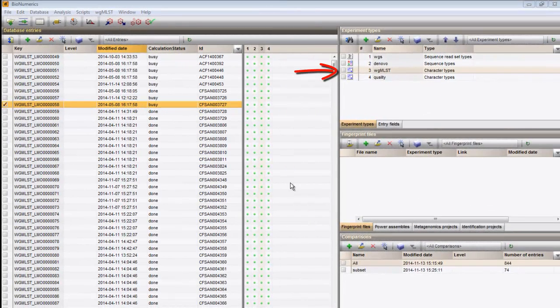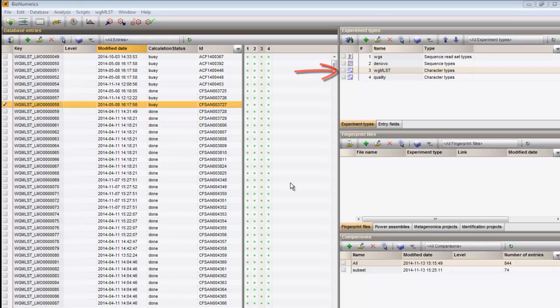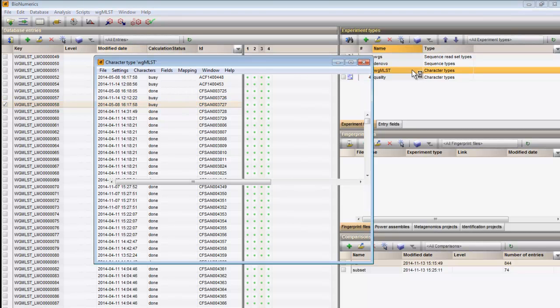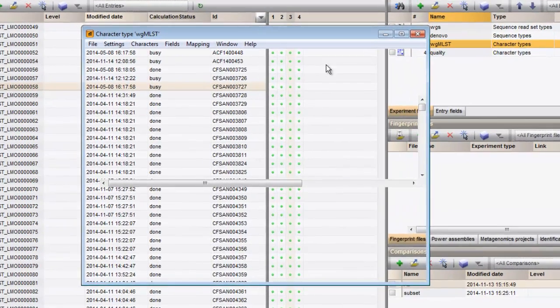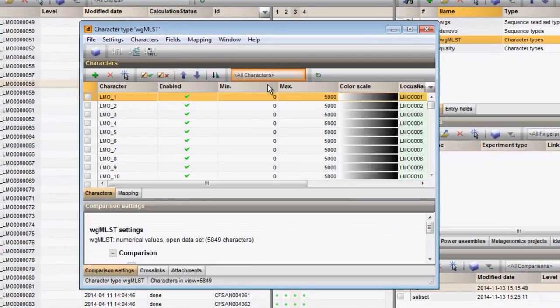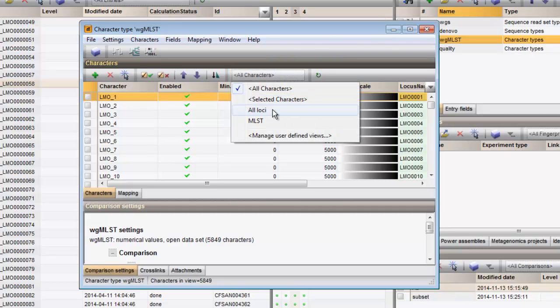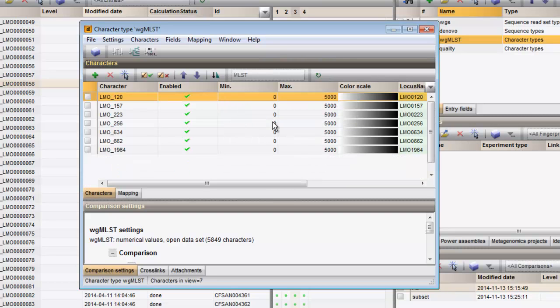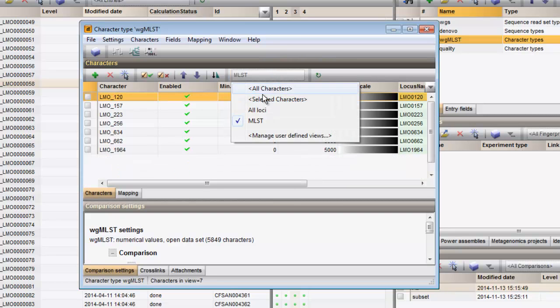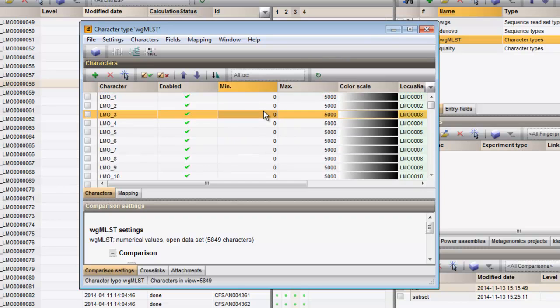The whole genome MLST character type experiment that was created contains a number of subsets. I have here all Loci and MLST. User defined subschemes can be added as well.